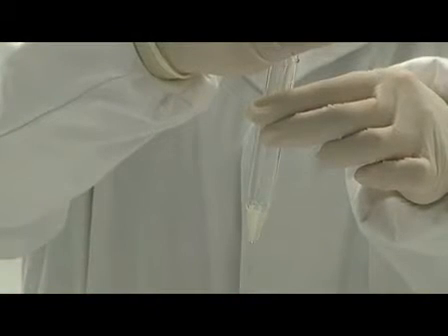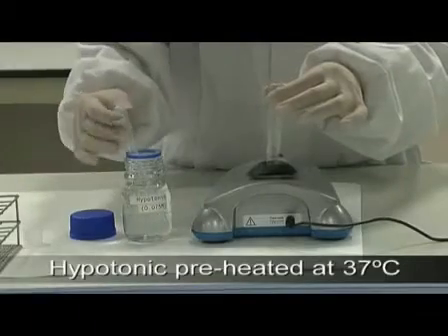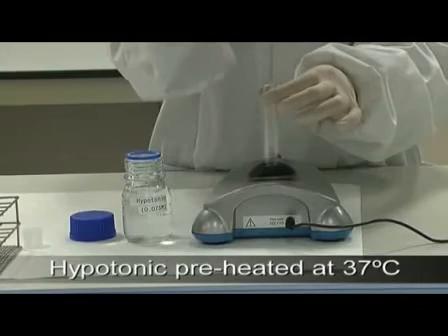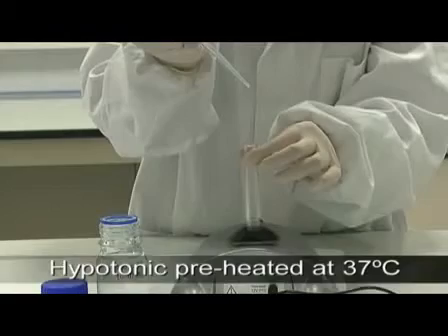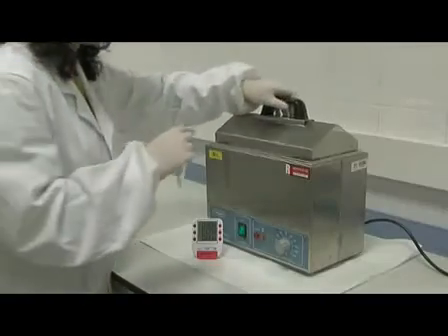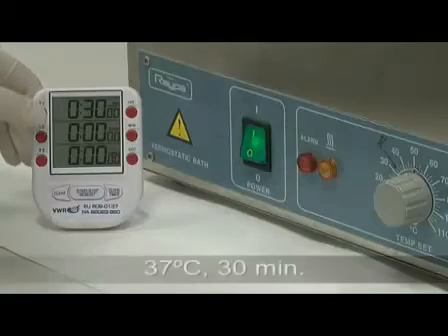Now, gently remove the supernatant. And add the hypotonic solution drop by drop until you have a volume of about 10 millilitres. This tube must remain at 37 degrees C for 30 minutes.